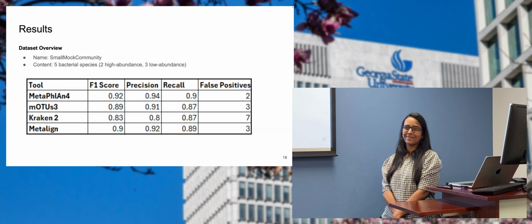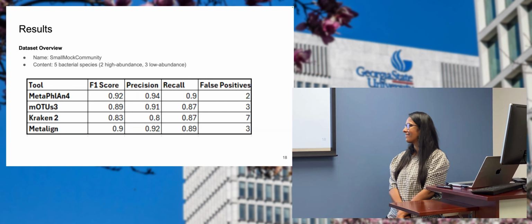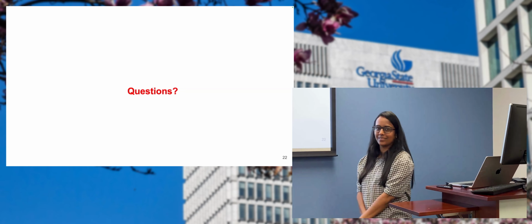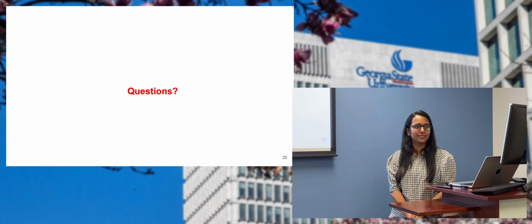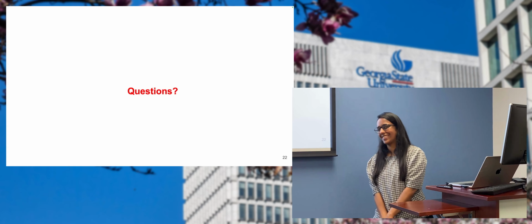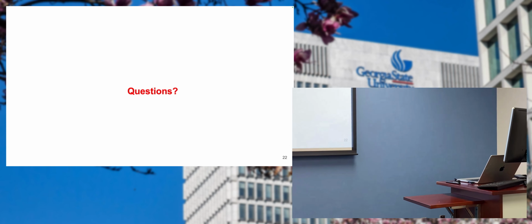At the species level, this is SARS-CoV-2, of course, we know. Then what's next? At least 2,000. Right, that's great. Don't forget to validate.